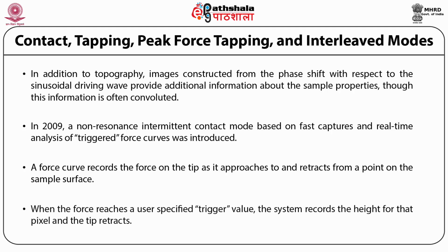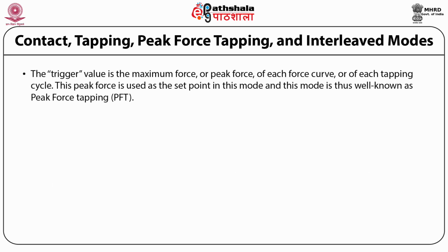When the force reaches a user-specified trigger value, the system records the height for the pixel and the tip retracts. The trigger value is the maximum force, or peak force, of each force curve or of each tapping cycle. This peak force is used as the set point in this mode, which is well known as peak force tapping, in short PFT.